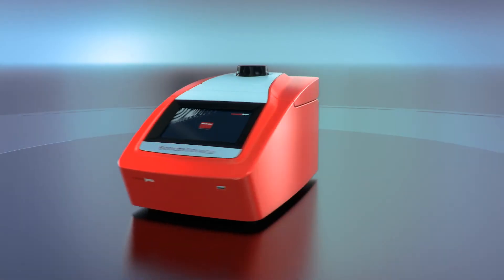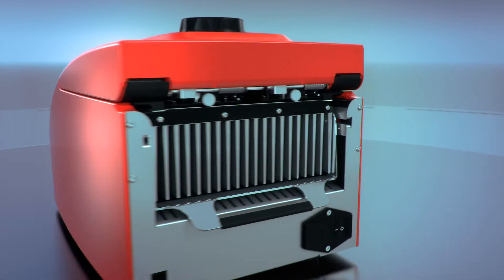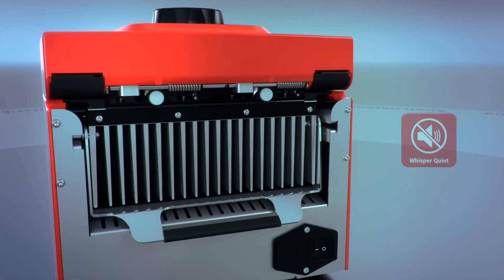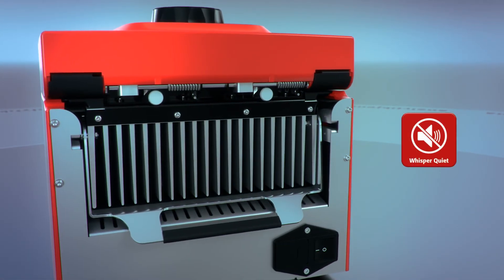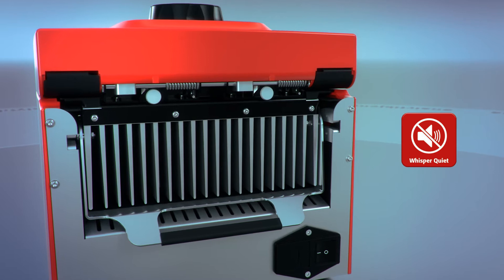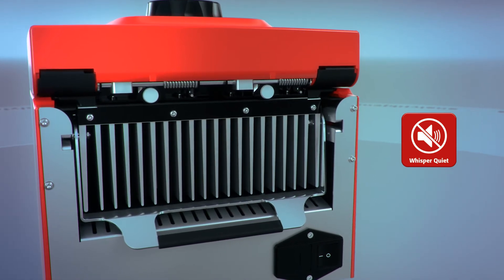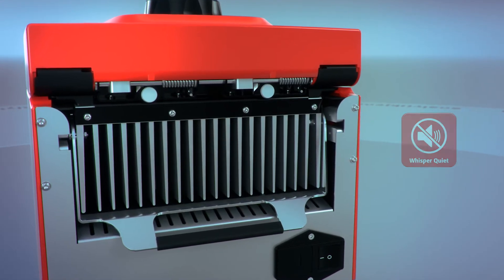The optimized airflow of the Biometra T-Advanced thermocycler keeps the maximum noise level of the instrument down to an extremely low maximum of 45 decibels.